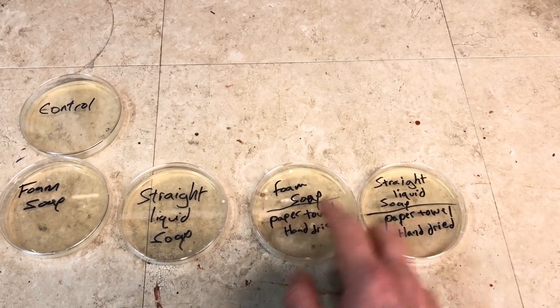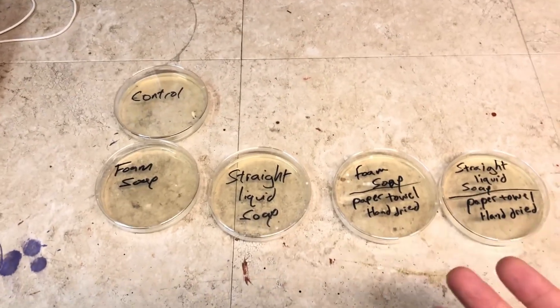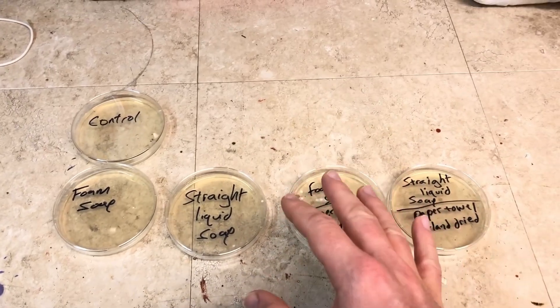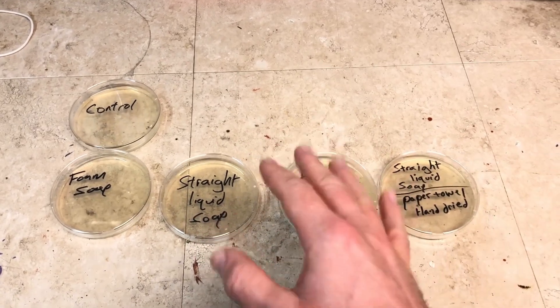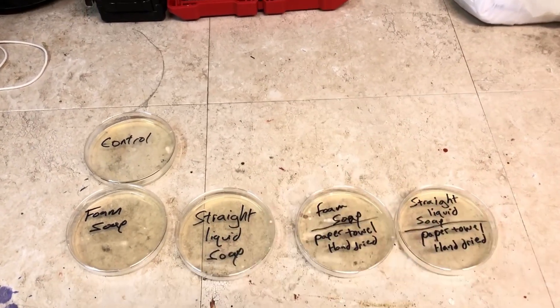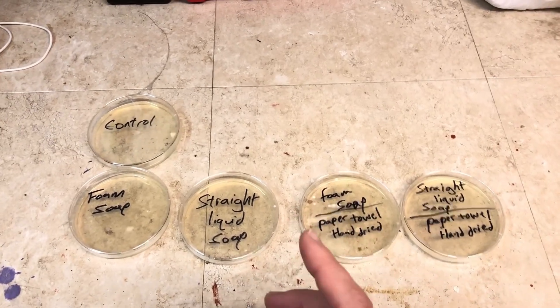I also did the same sequence again — foam soap then straight liquid soap — but this time I dried my hands with a paper towel before touching the plates. Now we're going to put these in my incubator over here. I have an inline thermostat, a heat mat, and a box with a rack in it. If you're interested in doing this experiment yourself, these nutrient agar plates are actually the safest form of petri dishes you can use. Links for the petri dishes and the inline thermostat will be in the video description below as affiliate links.